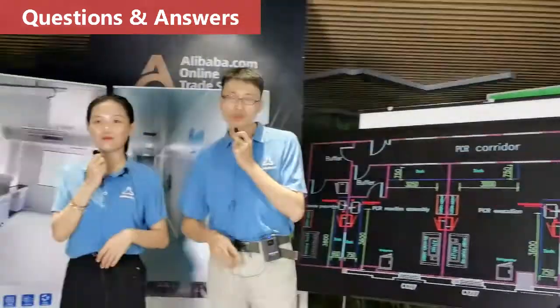So as you introduced just now, this negative or positive pressure shall be realized and maintained by the HVAC system, right? So I believe that you are also very professional on the HVAC system. I believe that our audience will have such questions about the PCR lab. But you know, time is running fast, and so I'm going to show.